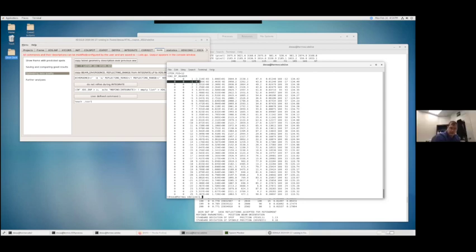So yes, Edwin, when you rerun integrate, it will overwrite anything that it normally generates. If I rerun integrate, it will overwrite the integrate log file, it will overwrite the integrate.hkl and any other parameters that it would write. So if you want to compare earlier runs to making a change and correct it, changing something and then rerunning it, you would want to create a backup of those results.